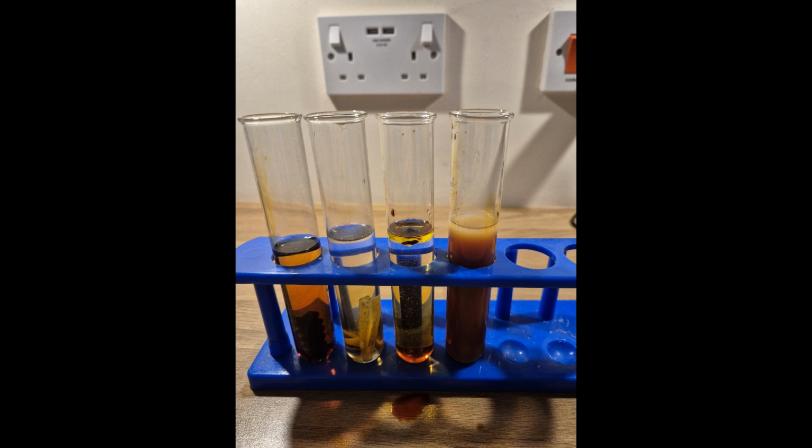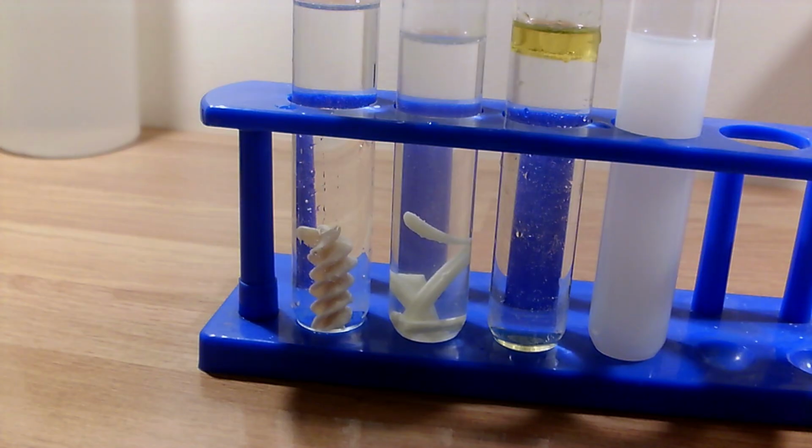We are now going to wash the test tubes so that we can do the same experiment again, but we are going to use ethanol instead of iodine because that is the food test for lipids, which is fat. We are using a pipette to add the ethanol, which is colourless, which is a sciencey word for clear, to the pasta. And then we are going to add it to the cheese and to the oil and to the milk.